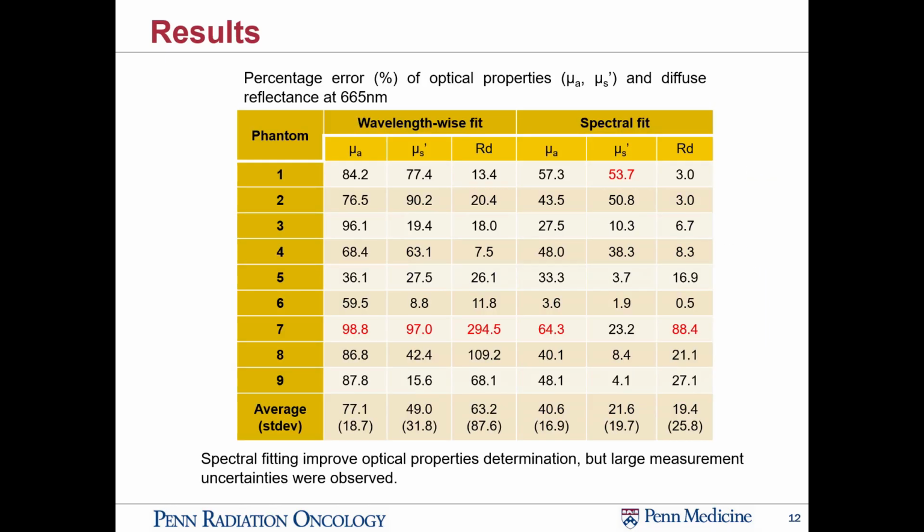We actually think that is due to contact problems. So this is a remeasurement of the same phantom with better contact between the contact probe and the phantom itself. Sorry, this is wrong. What I said is this is actually percentage difference. So the worst case percentage difference is shown here.